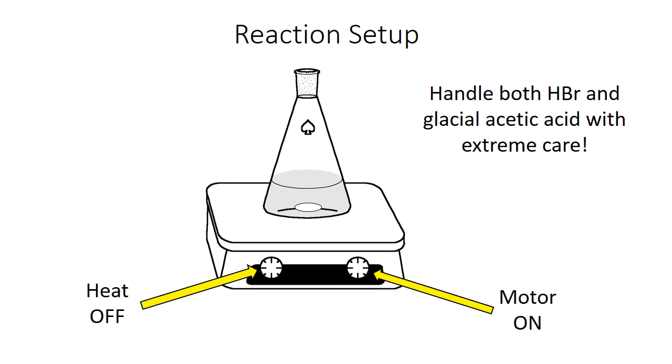The reaction stoichiometry is very complex. However, the reaction setup is very simple. We'll just be doing this in an Erlenmeyer flask on a magnetic stir/hot plate. Make sure that the heat on the hot plate's off and the motor is the only thing on.